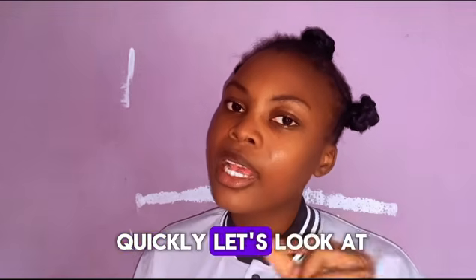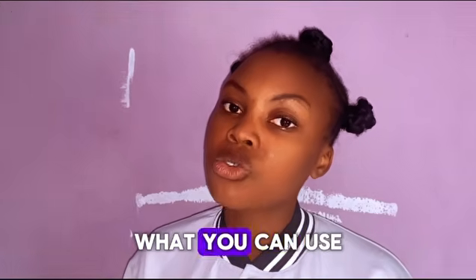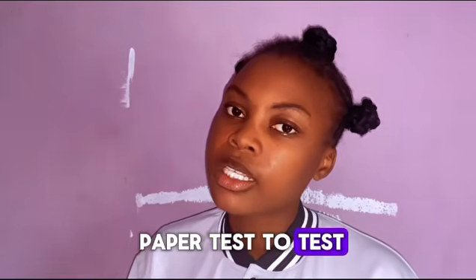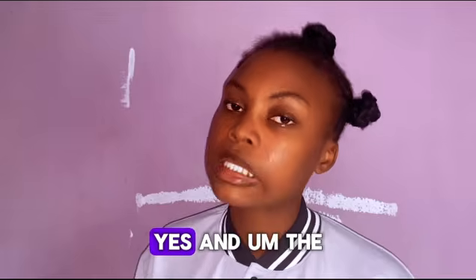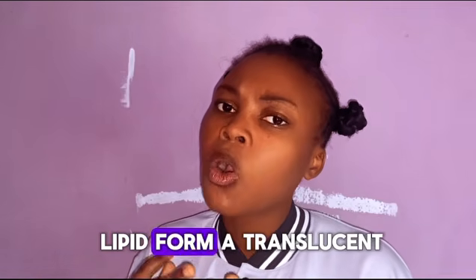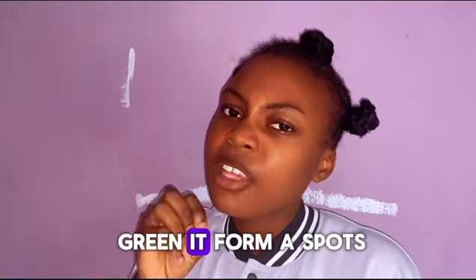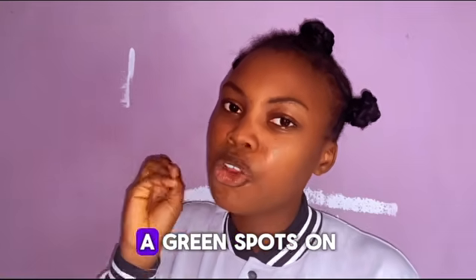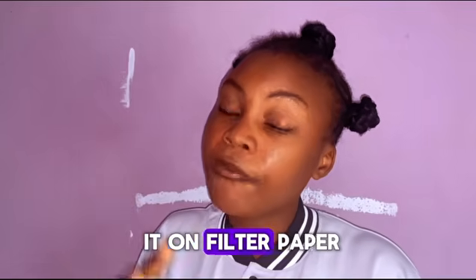So quickly, let's look at fat and oil. What you can use to test for fat and oil. You can use the paper test to test for fat and oil. Yes. And the lipid forms a translucent spot. You will be seeing spots on it, a translucent spot on filter paper.